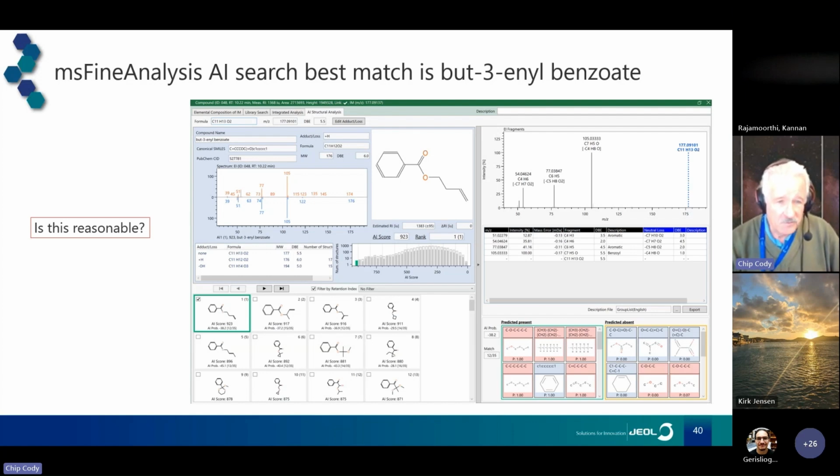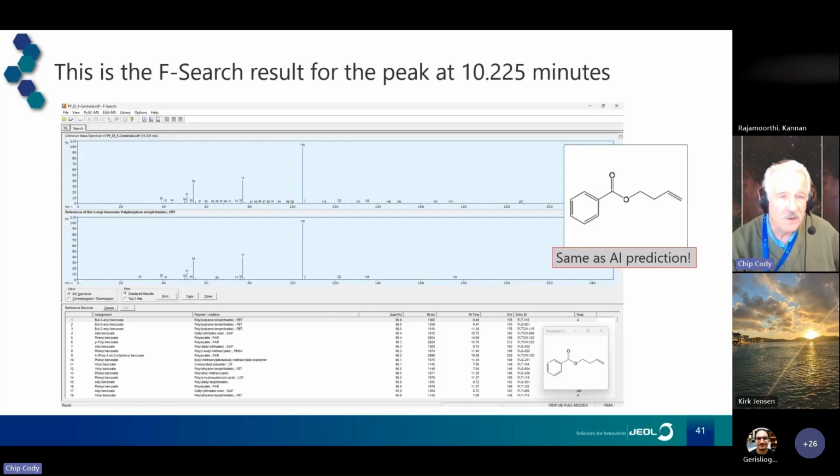What I'll often do is take a candidate structure like this and feed it with the measured mass spectrum back to the NIST-MS interpreter so that I can see if the exact masses for the fragments match nicely with the predicted structure. Again, all of these are just tools, but that and the NIST hybrid search, all of these are really helpful ways to try to look at this sort of thing.